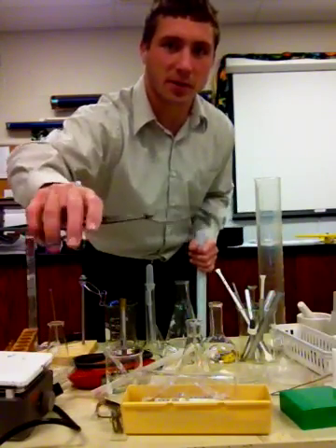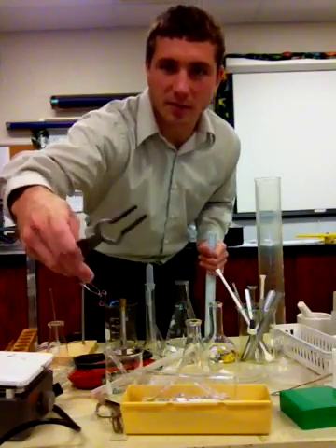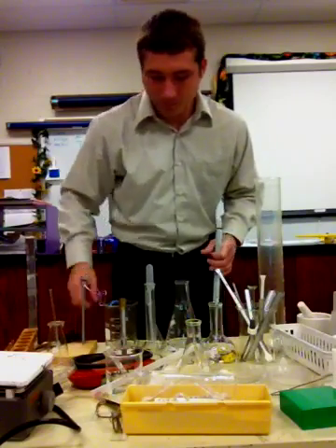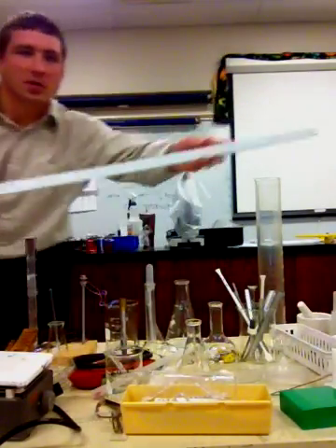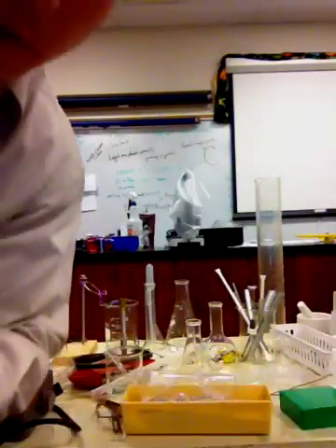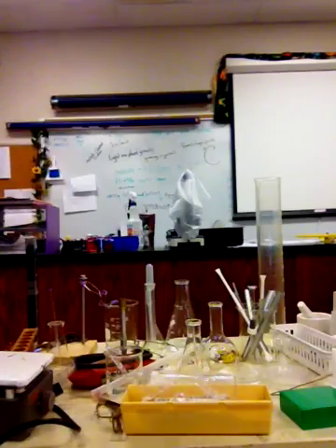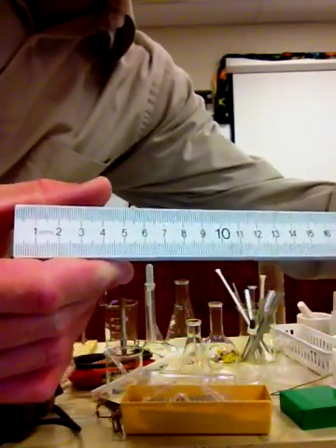Next we have the regular tongs. These do not have the rubber ends. I'm holding in my hand a meter stick, and if you look closely you'll notice that it is in metric — that is centimeters — and the other side also has millimeters.